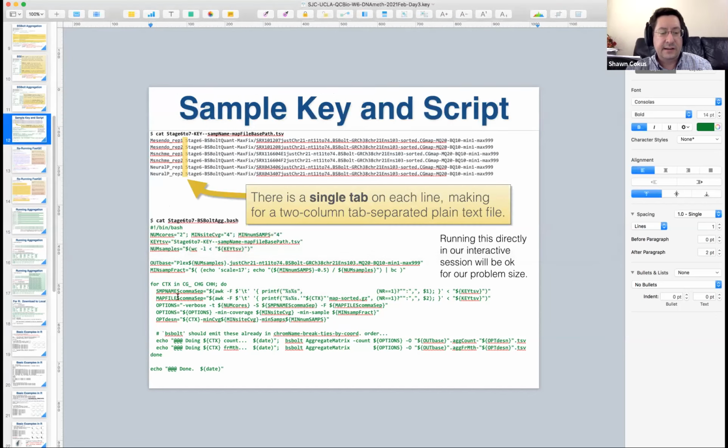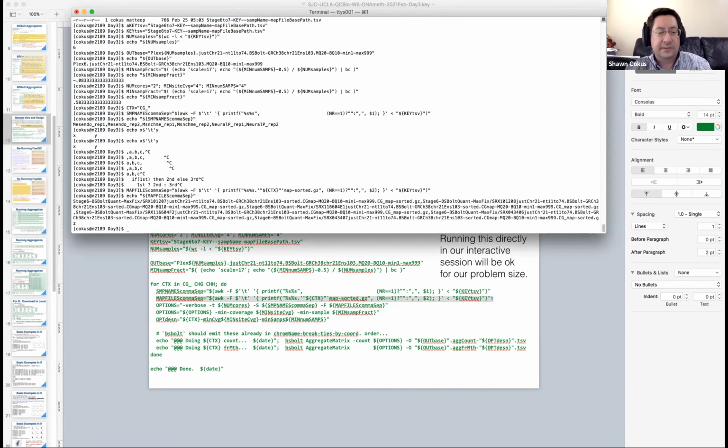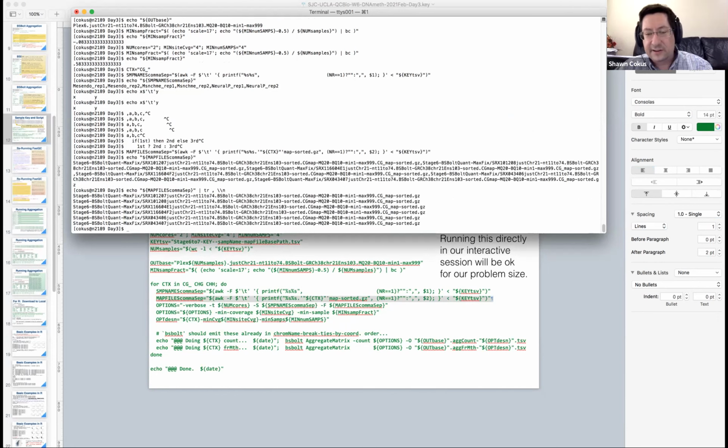Okay, so the next line is exactly the same analogous thing, but for the file names, which are also much nastier, so it's going to be ugly. But how that's computed in the script is exactly the same. It's there, and if we tr the commas to new lines, at least you can kind of see that it's right, and the commas are in there, right? So that's all well and good.